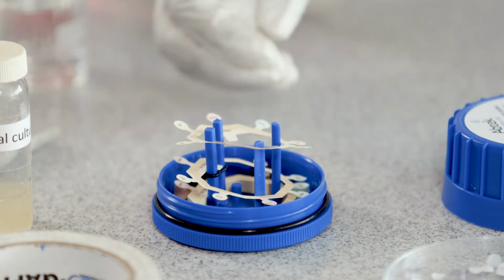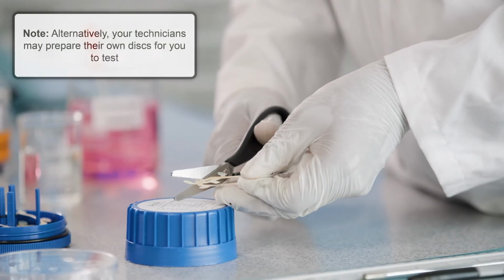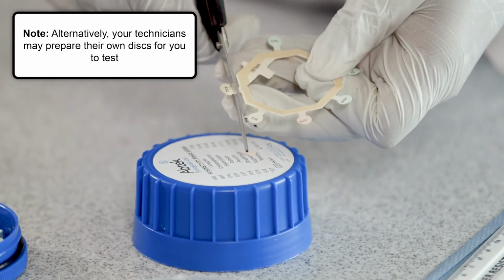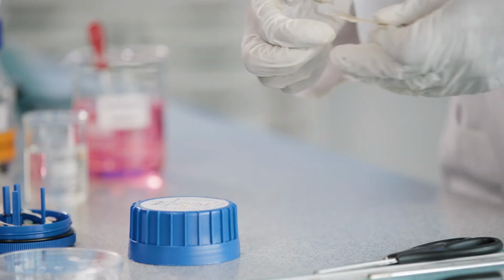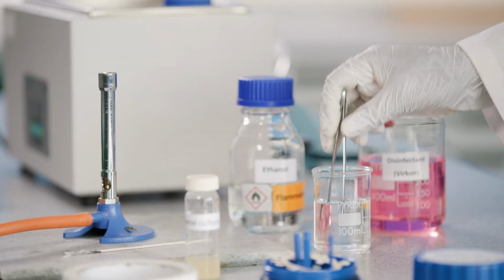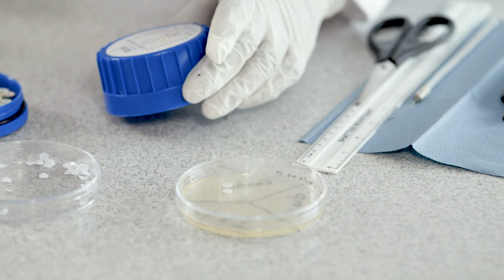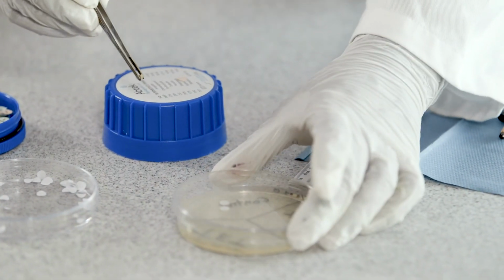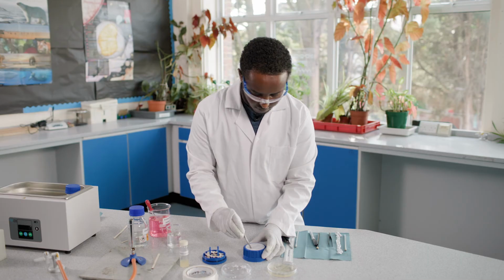You are now ready to prepare your antibiotic discs. Use your scissors to remove the specific antibiotics you wish to investigate. Sterilize the forceps by dipping them into ethanol, then passing them through the Bunsen flame to ignite the ethanol. Then repeat the previous step with the 2 antibiotic discs, placing each on the appropriate section of agar. Remember to replace the dish lid as quickly as possible.